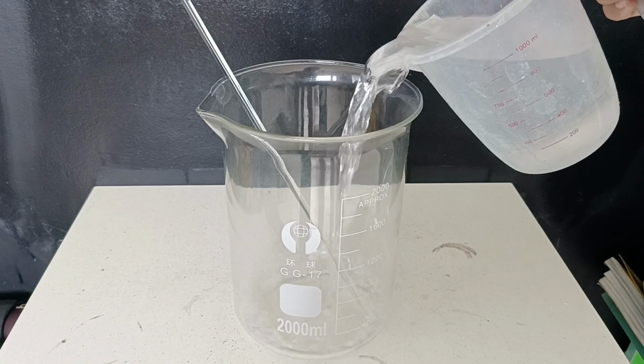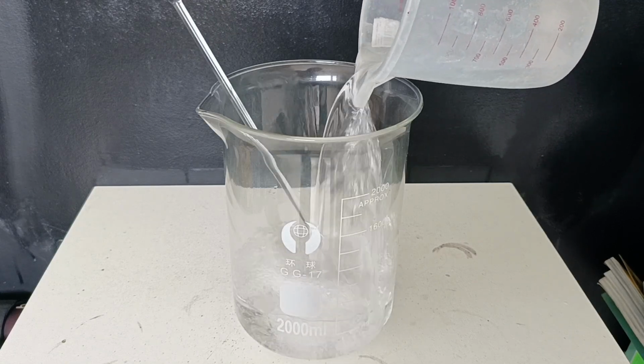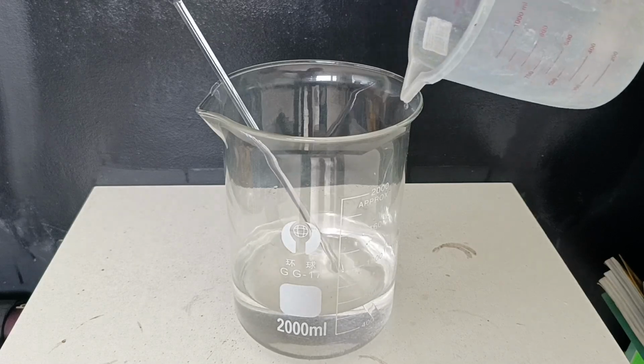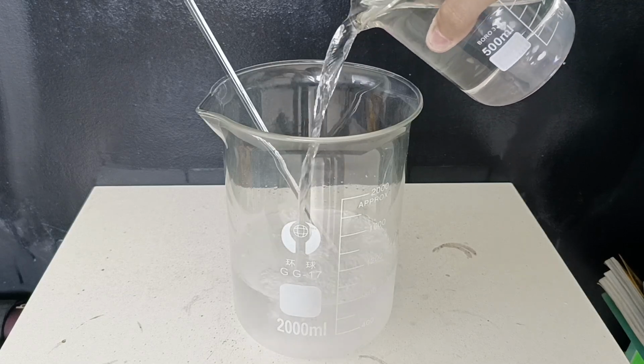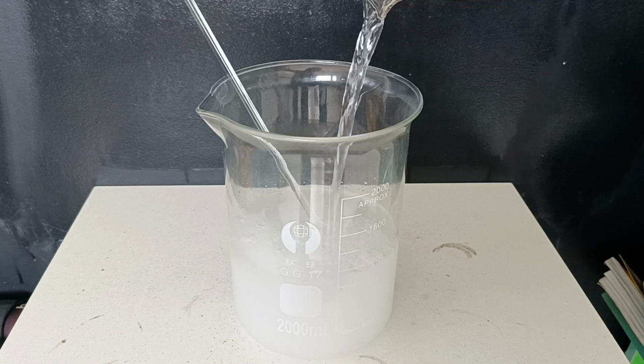I first added the 1 liter of lacquer thinner to a large 2-liter beaker. To the lacquer thinner, I added around half a liter of water. This gets rid of most of the acetone and some of the methyl isobutyl ketone and 2-butoxyethanol.